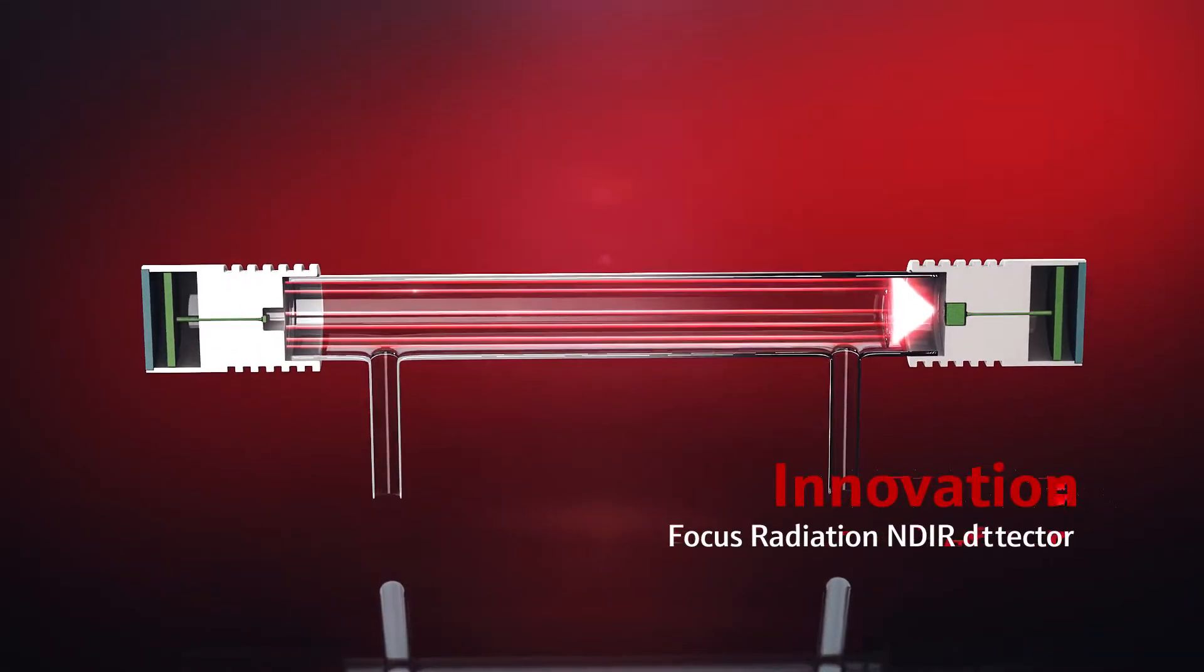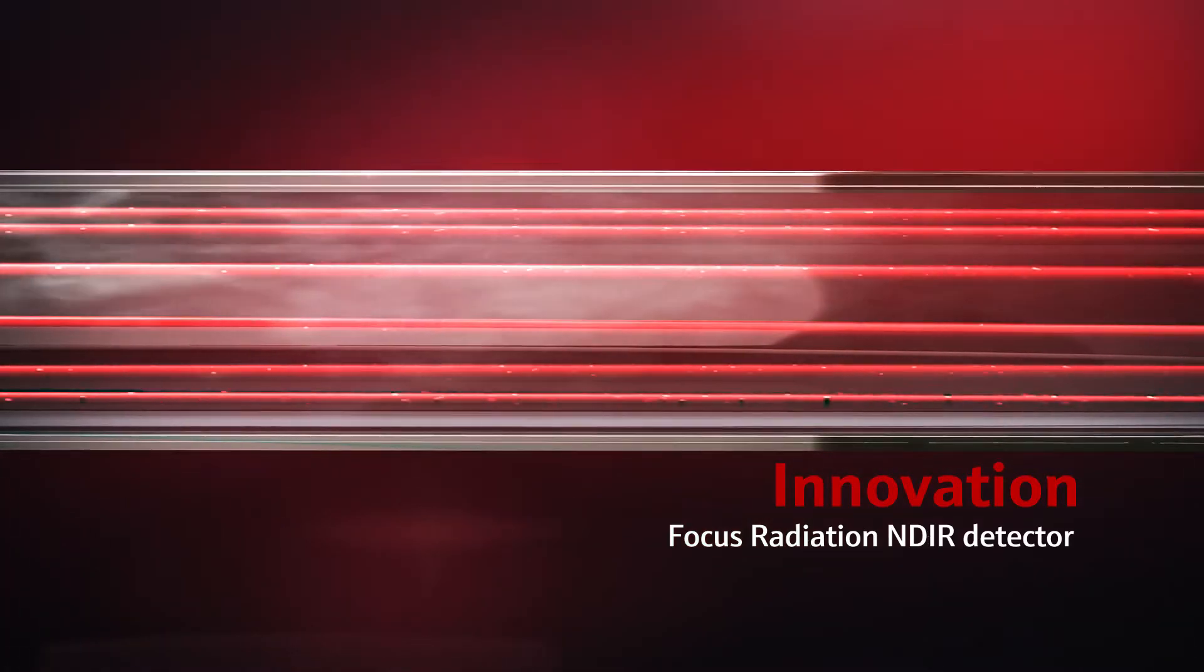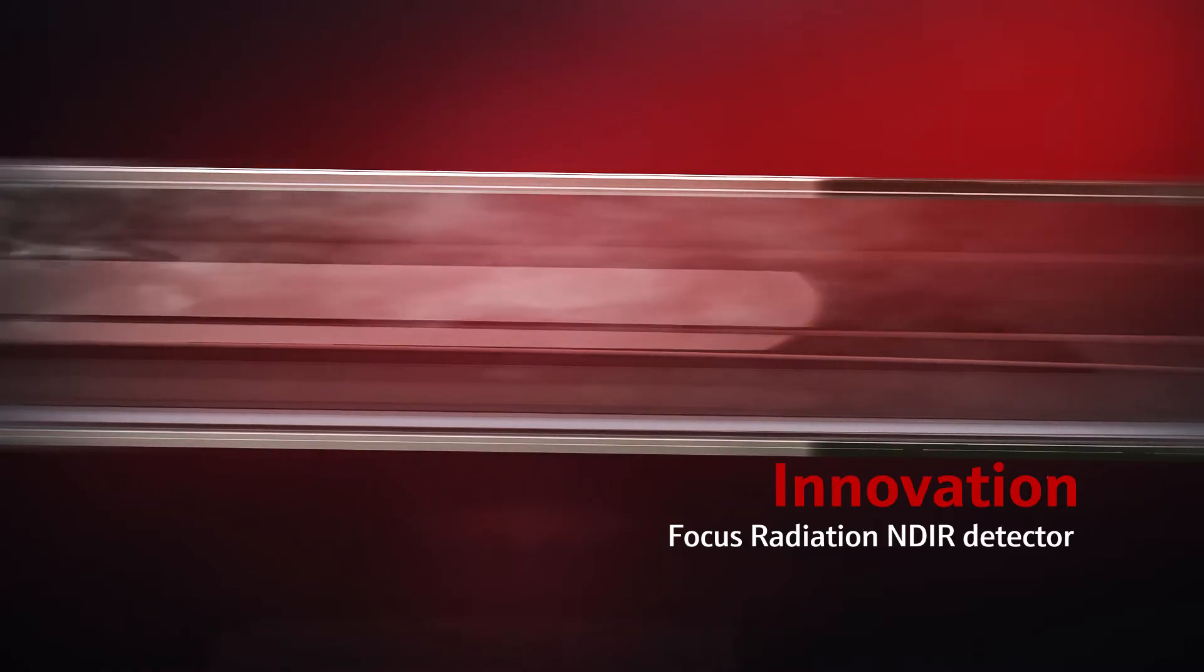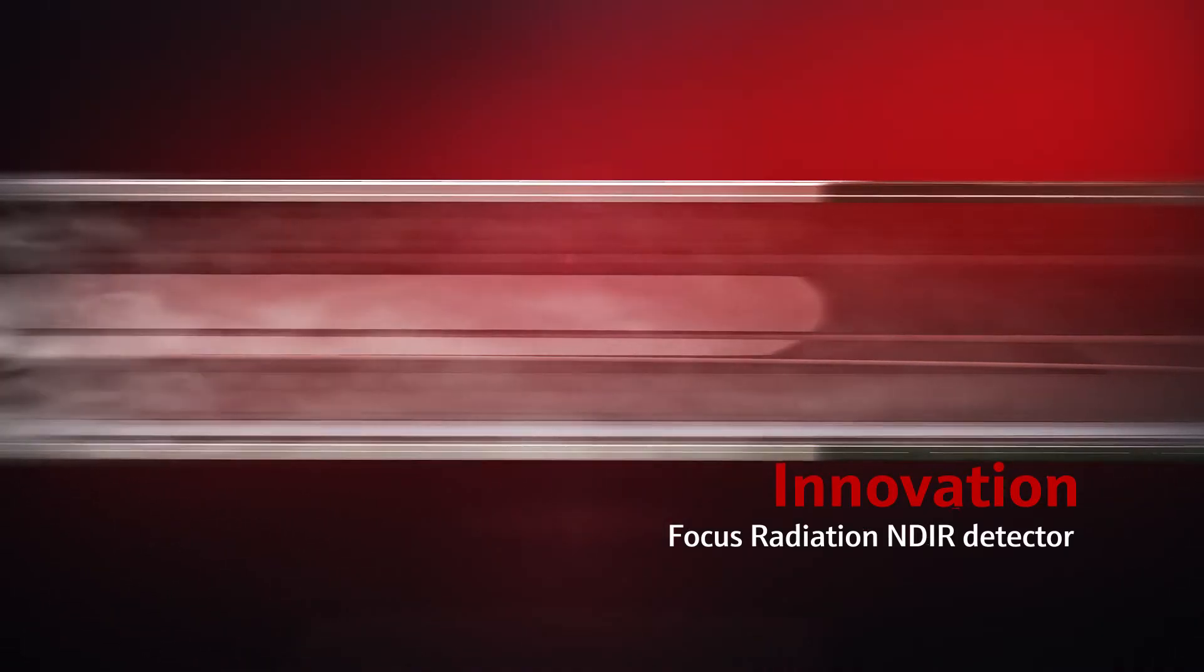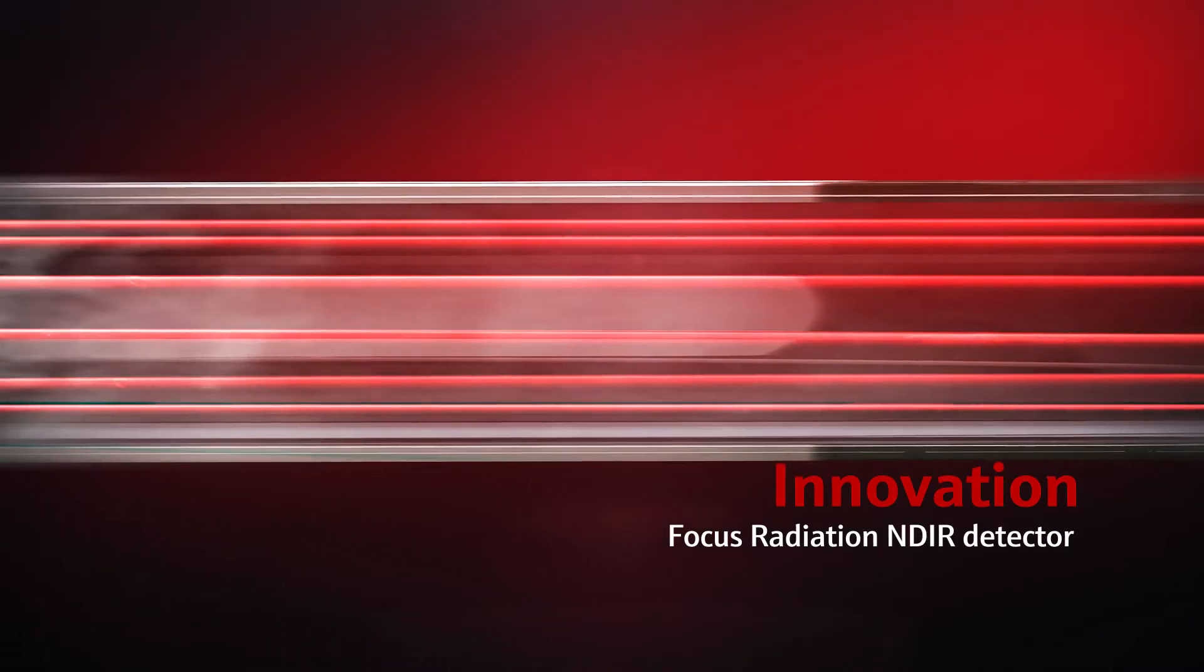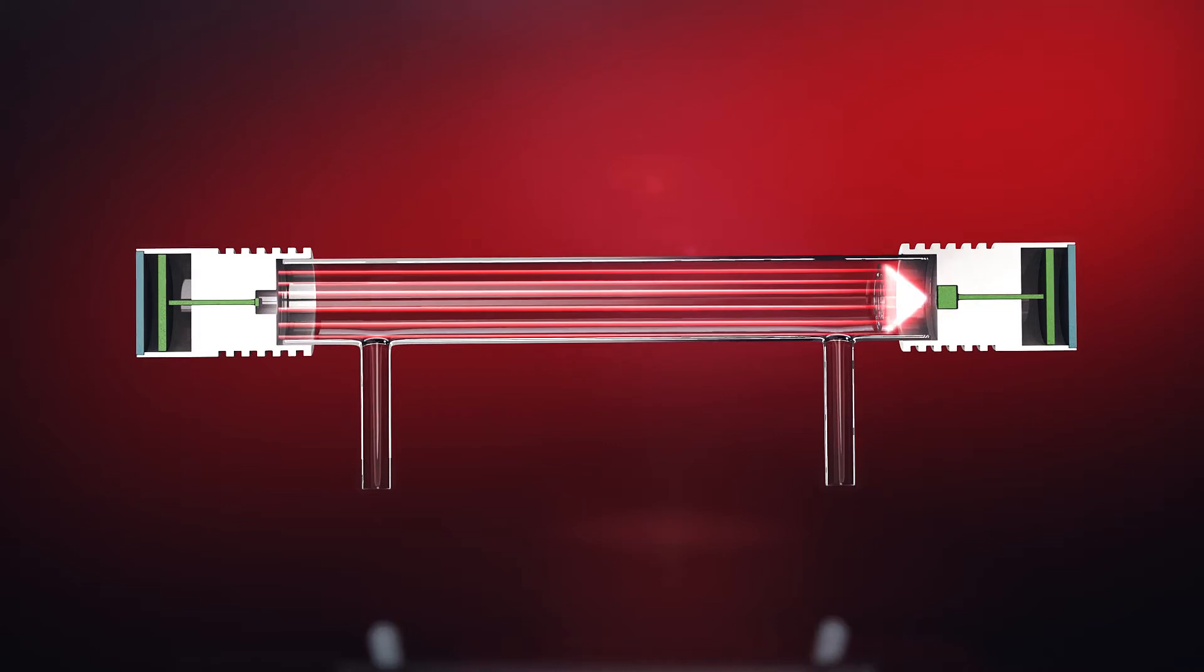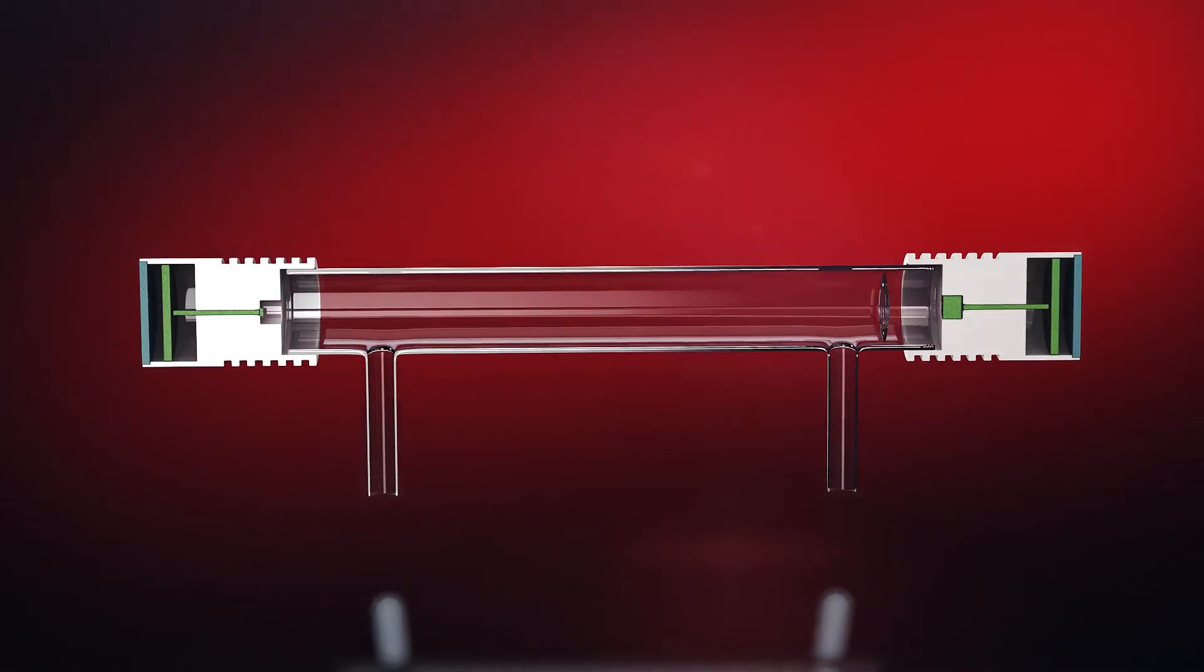As a market leader in optical spectroscopy, Analytic Jena assures that our TOC analyzers contain top quality and durable optical components. The corrosion-free focus radiation NDIR detector and the Vita flow management guarantee excellent long-term stability and reliable results.